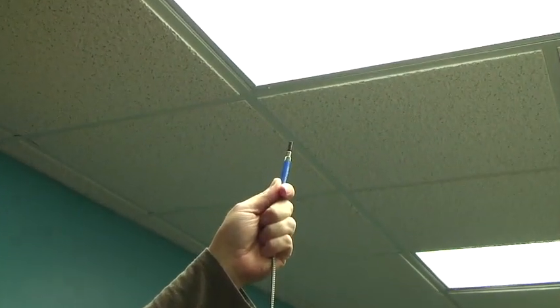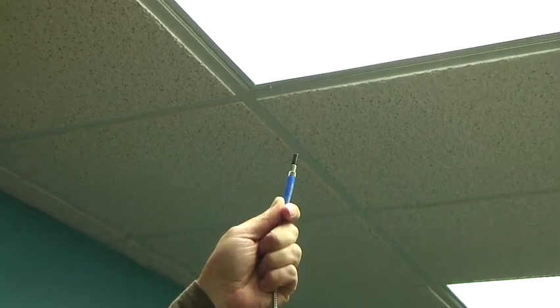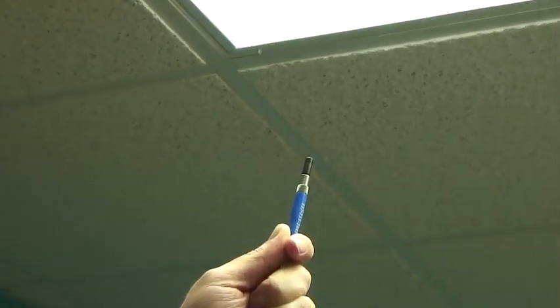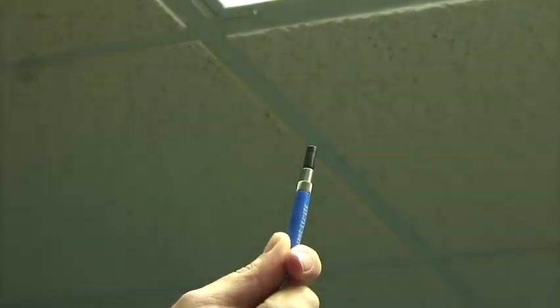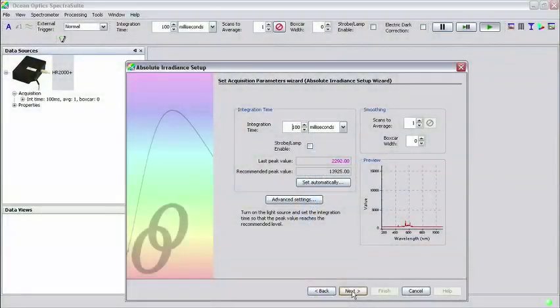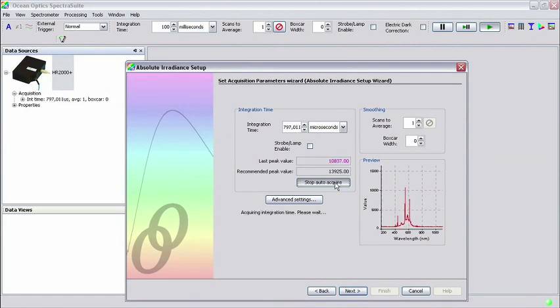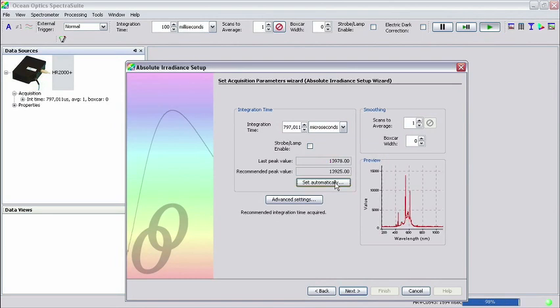Clicking the Set Automatically button lets the software select the best integration time for your experiment. Add any averaging and boxcar at this point and then click Next.